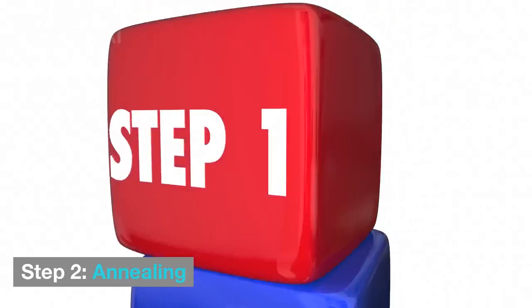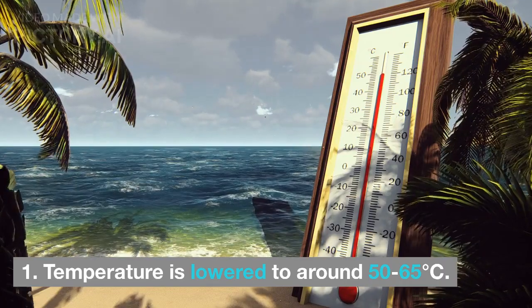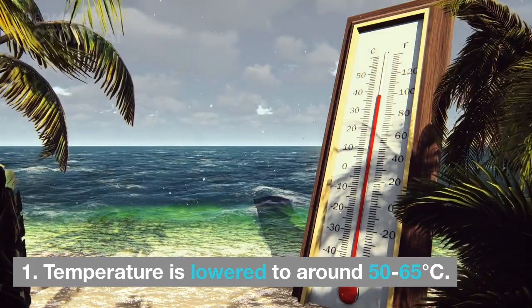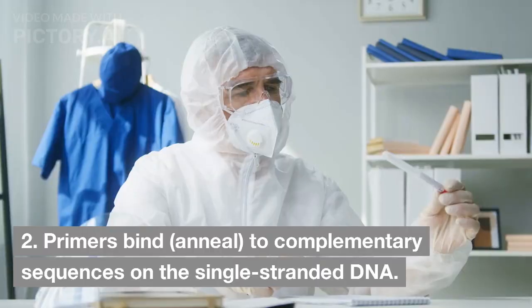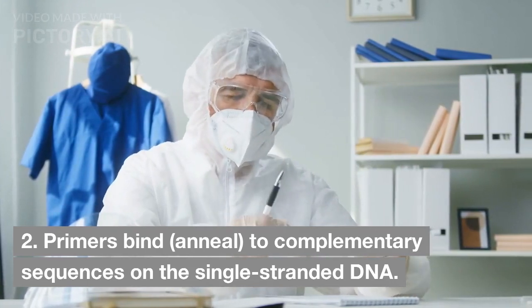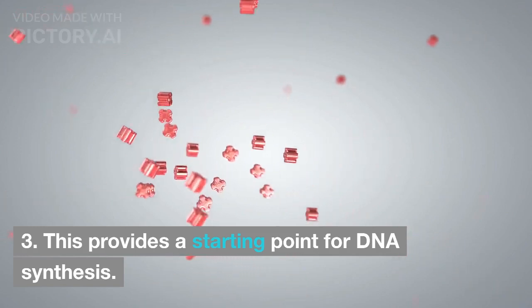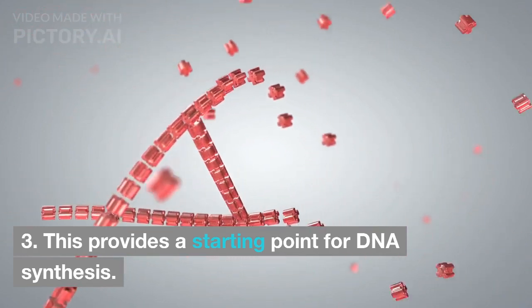Step 2. Annealing. Temperature is lowered to around 50–65 degrees Celsius. Primers bind, anneal, to complementary sequences on the single-stranded DNA. This provides a starting point for DNA synthesis.